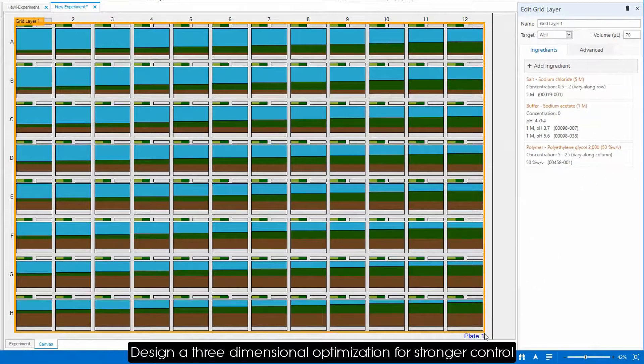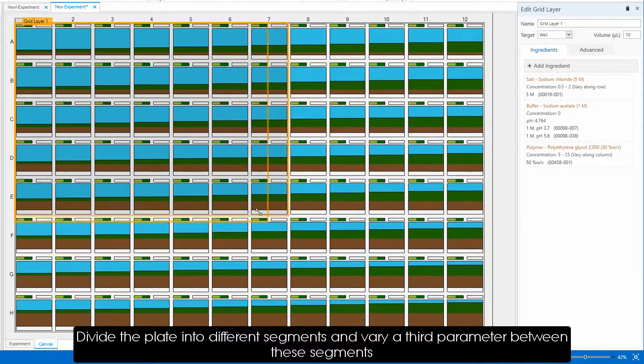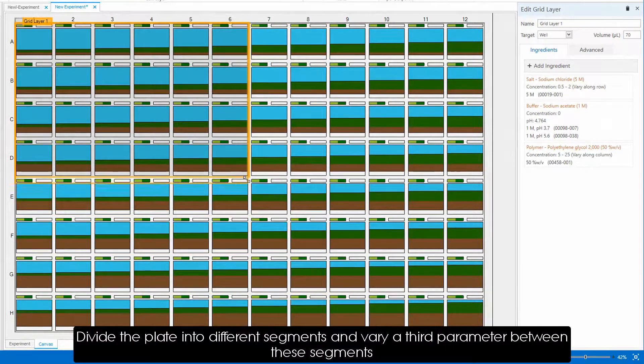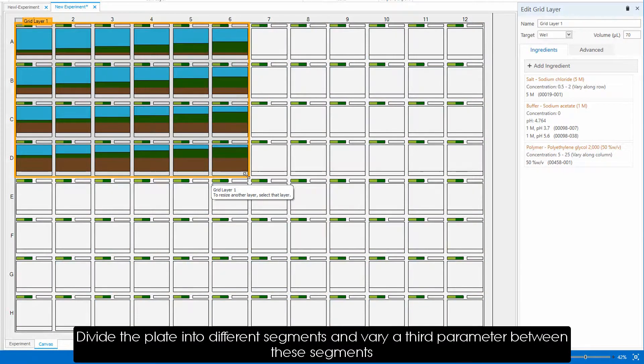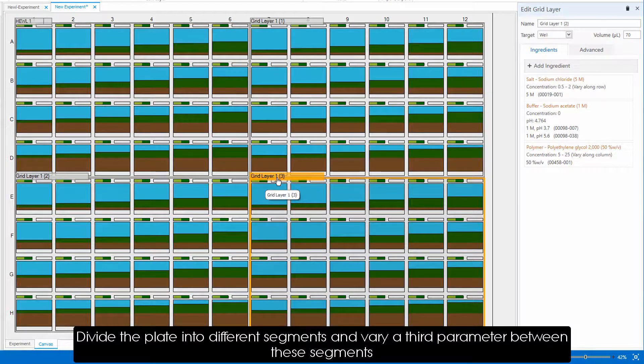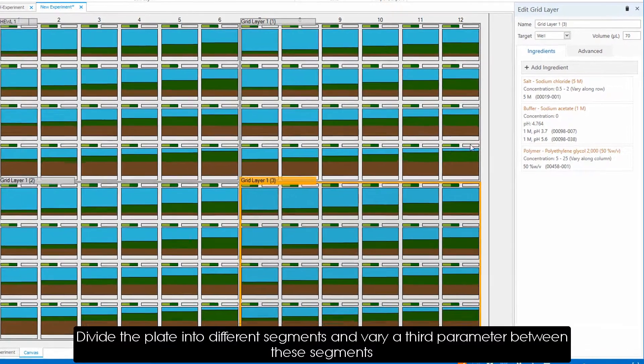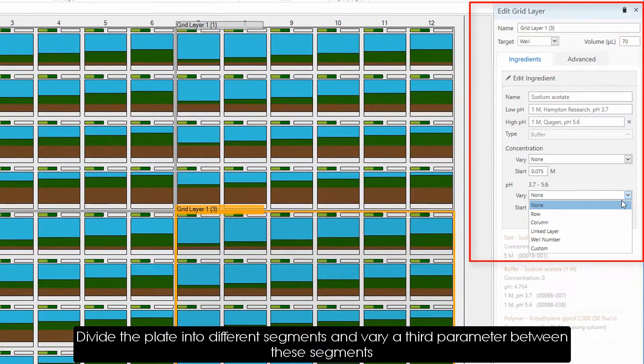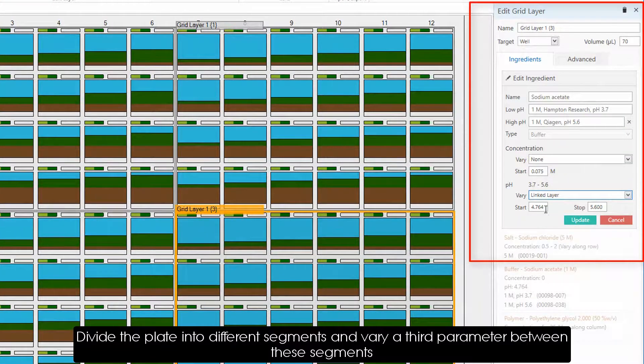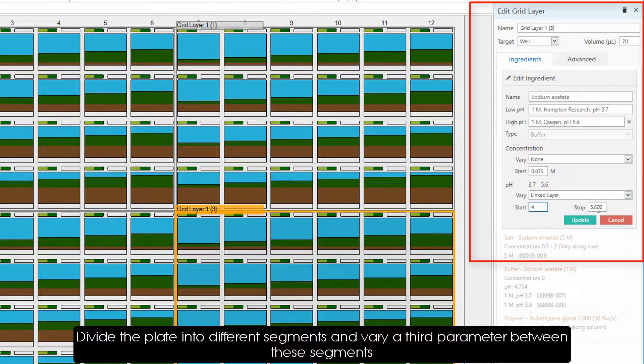For a three-dimensional optimization, divide the plate into different segments and vary a third parameter between these segments for an even stronger regulation of your condition. In this example, each of these segments will have a different pH.